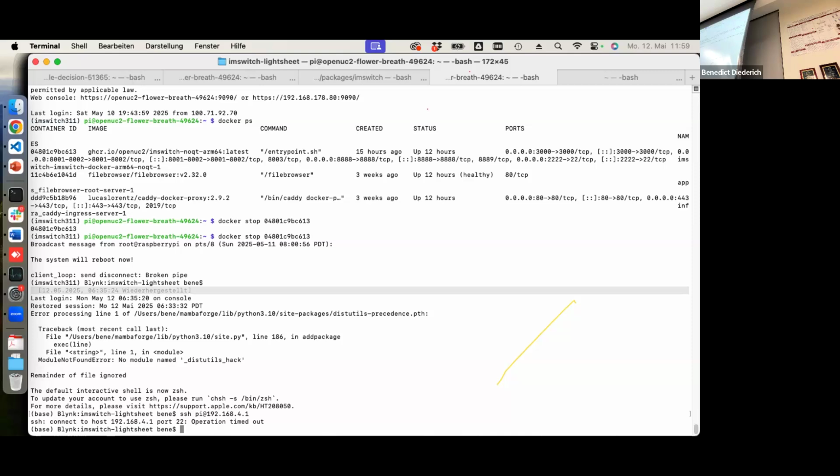I've been thinking about, like, I haven't finished how we can scan around. I do want to do it.